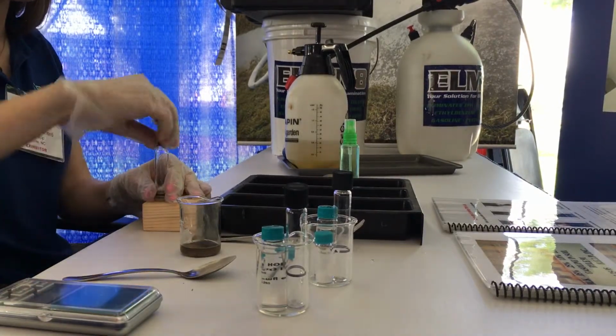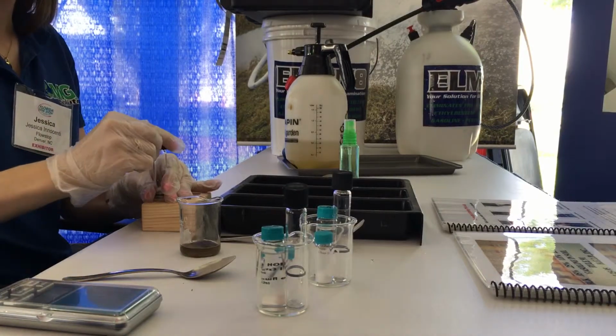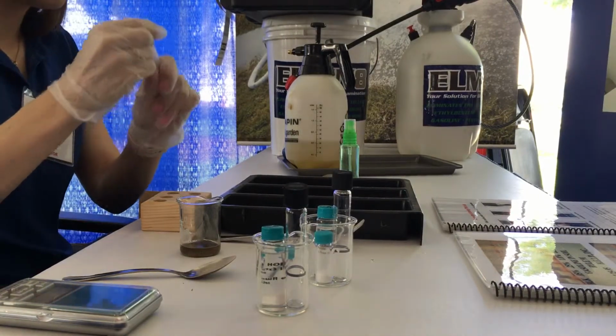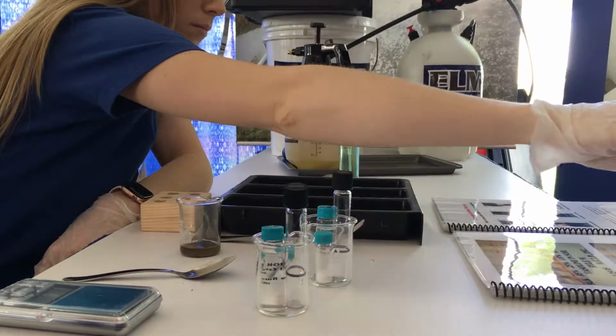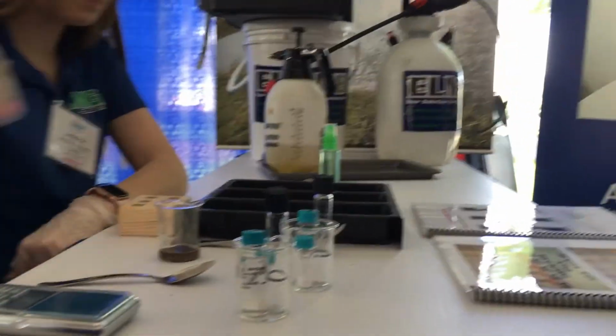So in this case, again, we're showing you the soil is clean, which is represented by the white. So we know we have white. We're starting with clean soil.